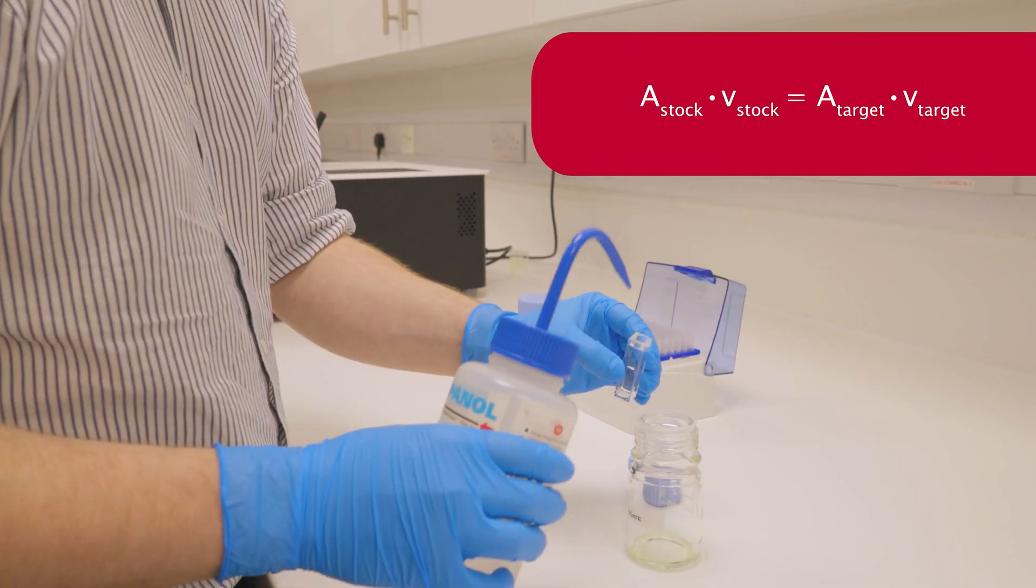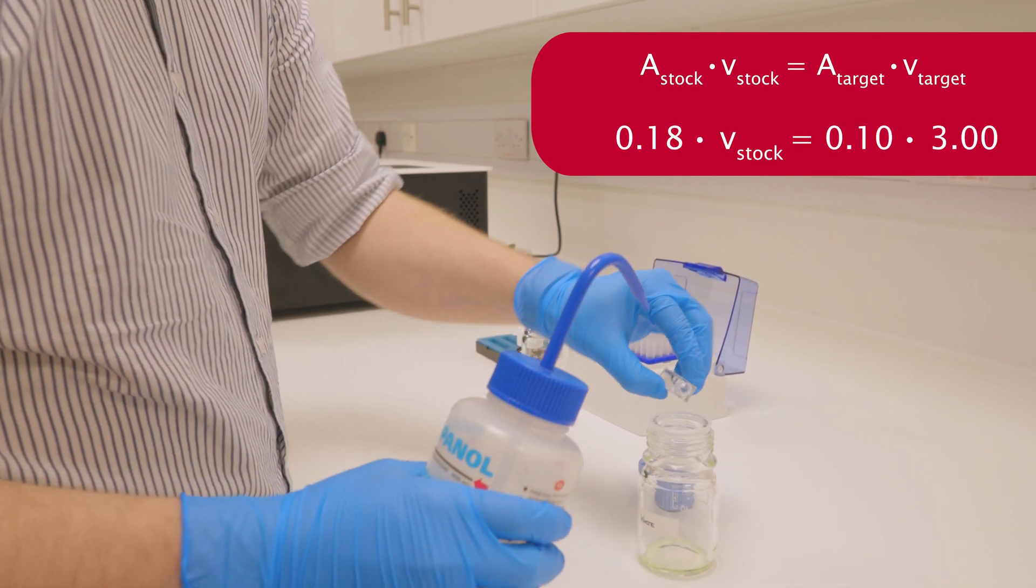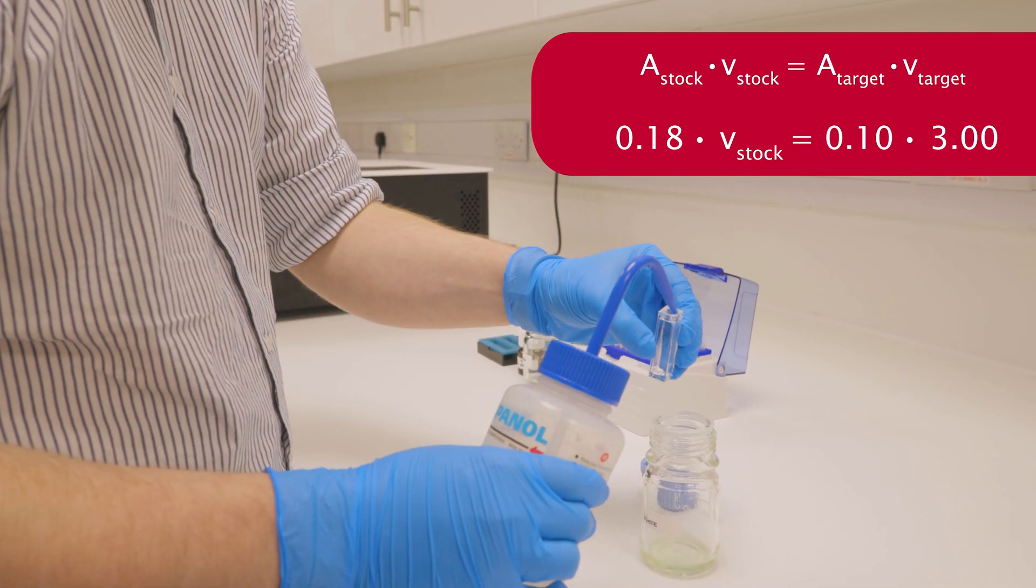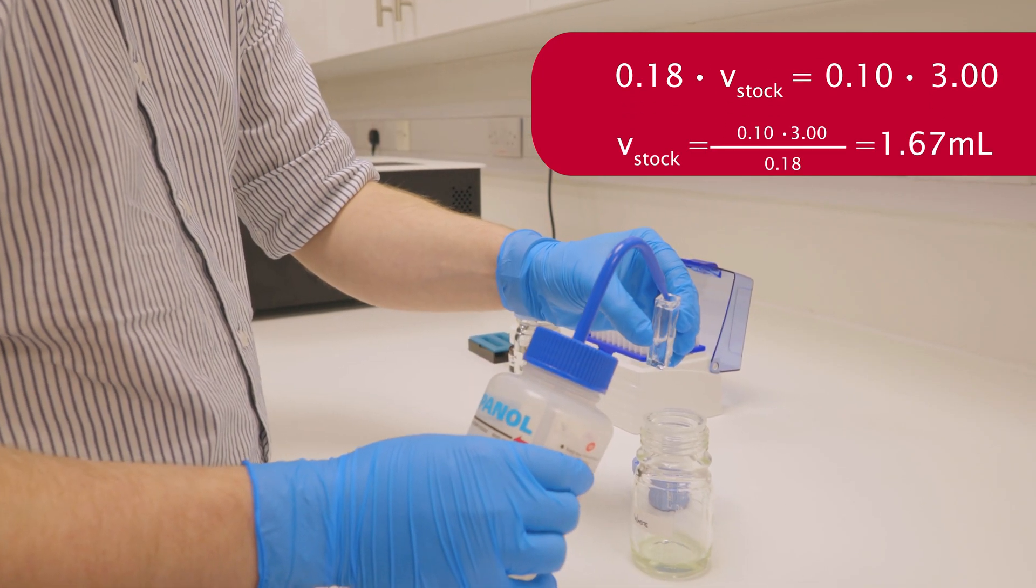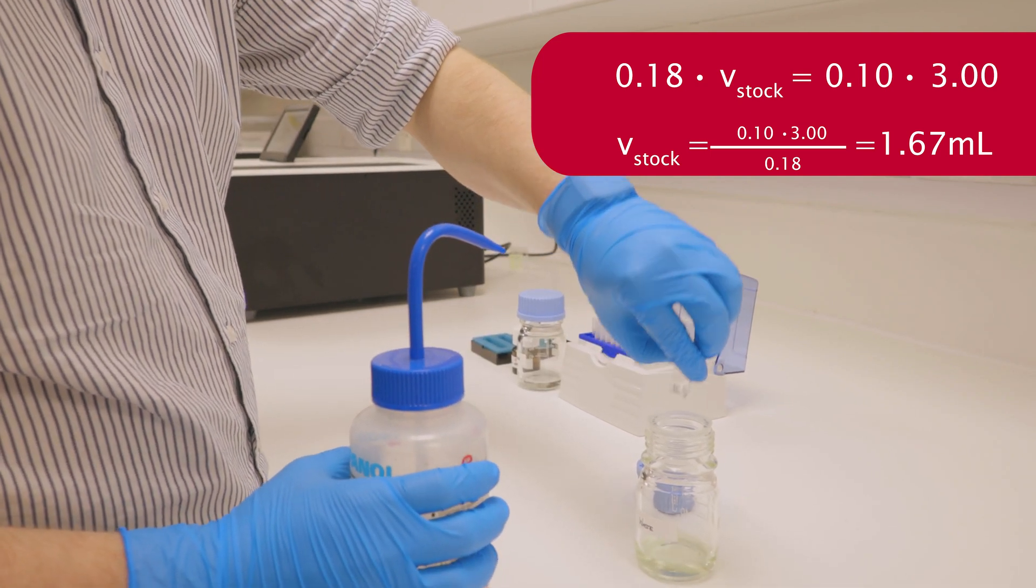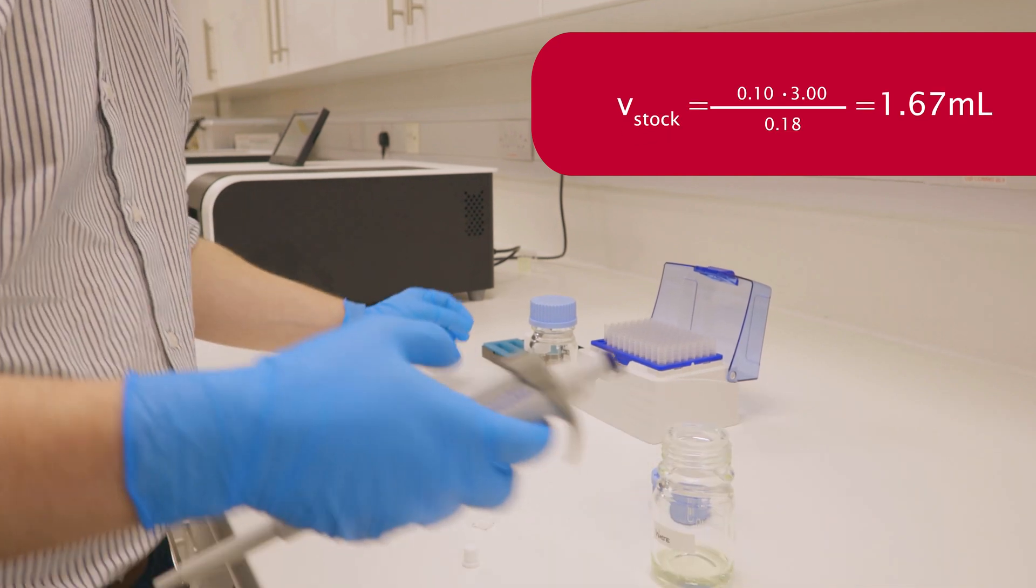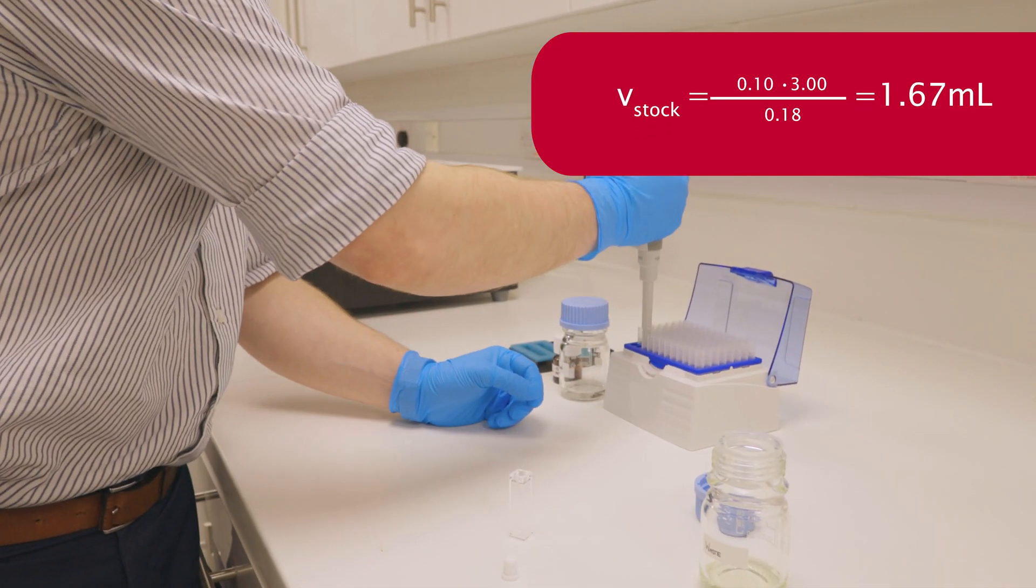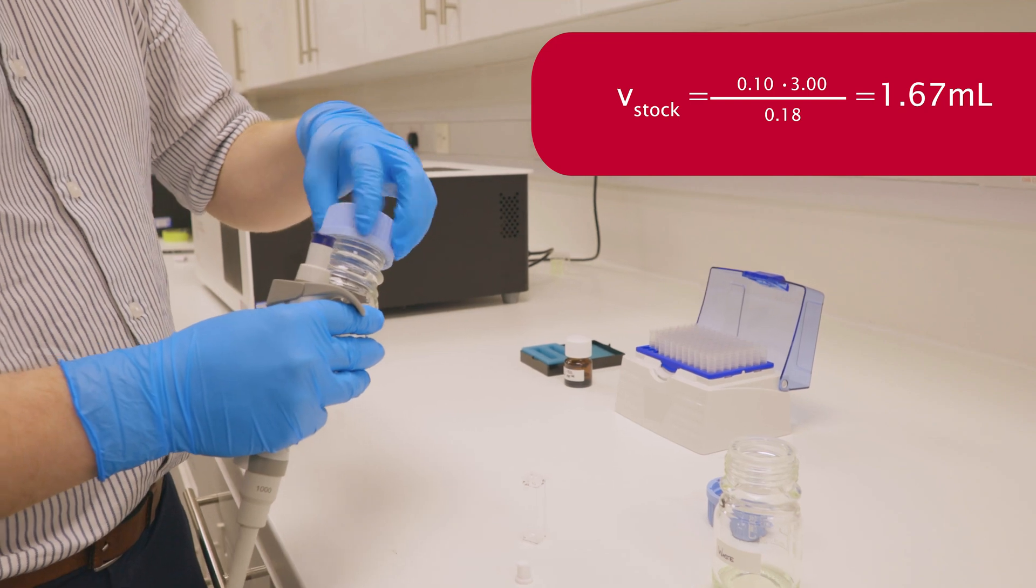Our stock solution absorbance was 0.18. Our target absorbance is 0.10, and our target volume is 3 milliliters, which we recommend for standard path length cuvettes. Rearranging and solving this equation, we determined that we require 1.67 milliliters of our stock solution diluted with 1.33 milliliters of solvent to produce our final 3 milliliter sample.